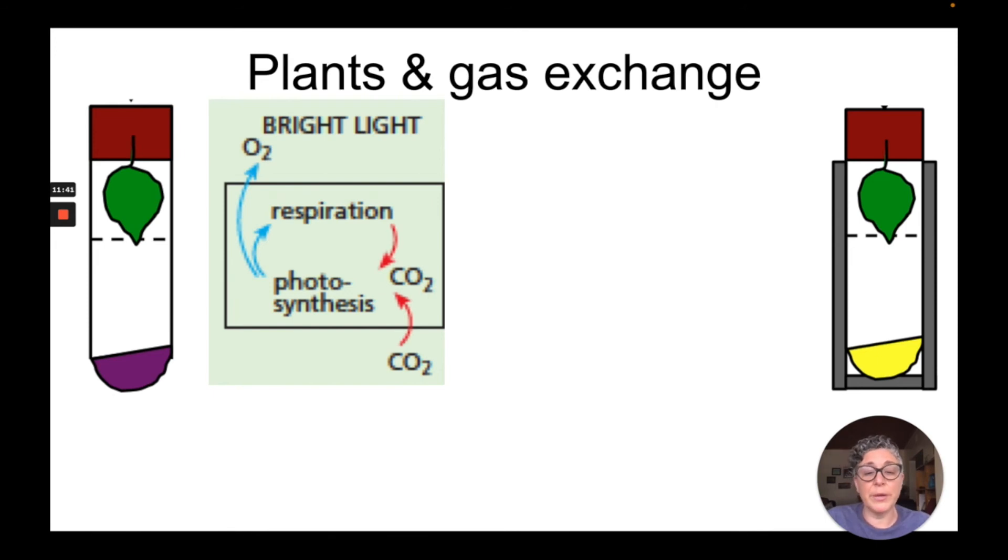The plant is using up all the carbon dioxide from the atmosphere, in this case the test tube, thereby turning the hydrogen carbonate indicator purple. So we see that in bright light, plants do photosynthesis and respiration.